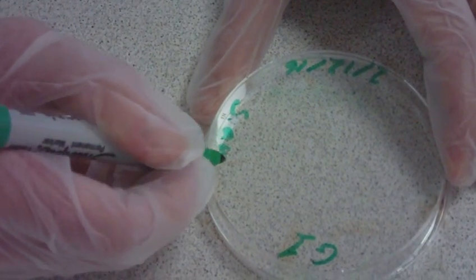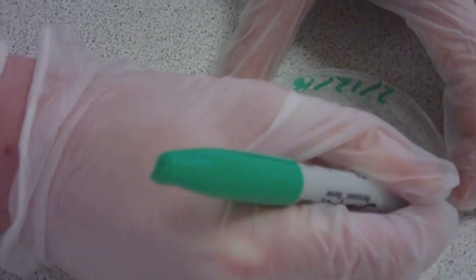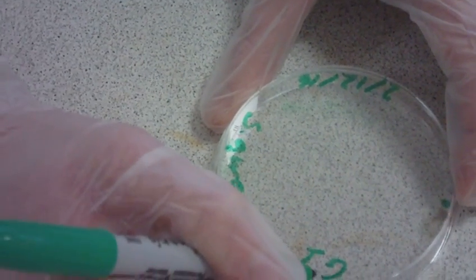Also, mark the underside of the plate using dots as you would see at 12, 3, 6, and 9 o'clock. This will help when streaking the plate.